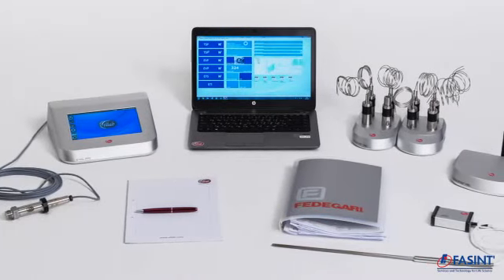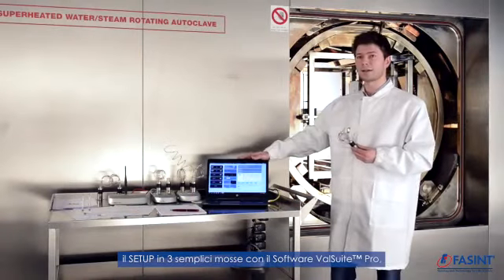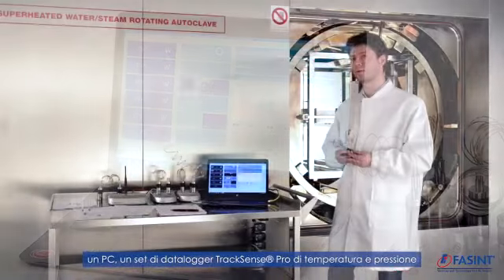I'm going to show you a start-up procedure and how easy it is in a few steps. We have a validated ValSuite Pro software on this computer and a set of wireless loggers for temperature and pressure.